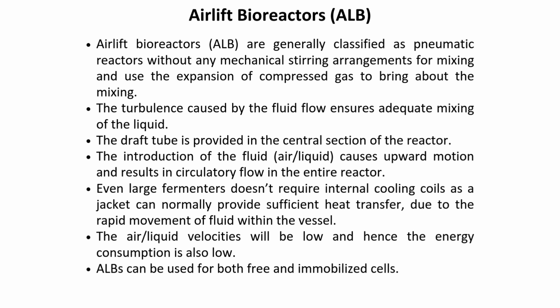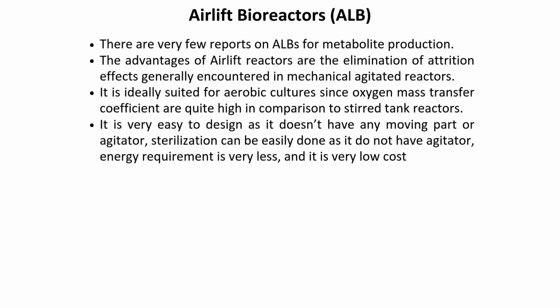When fluid, either air or liquid, is introduced, it causes an upward motion that creates a circulatory flow throughout the entire reactor. Even large airlift fermenters usually don't need internal cooling coils, because the rapid fluid movement allows a cooling jacket to provide sufficient heat transfer. The velocities of the air and liquid are relatively low, which means energy consumption is also low. Airlift bioreactors can be used for both free cells and immobilized cells. Coming up, we discuss the advantages of airlift bioreactors.